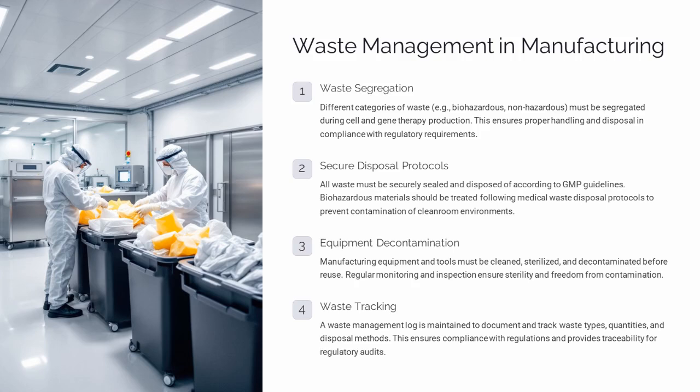Waste management in manufacturing includes waste segregation, secure disposal protocols, equipment decontamination, and waste tracking. These practices ensure compliance with regulations and prevent contamination.